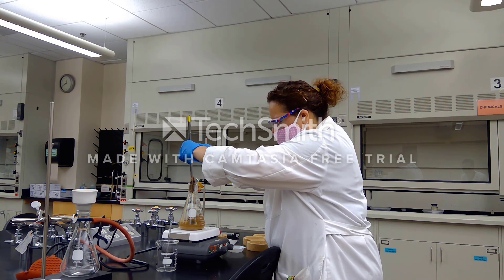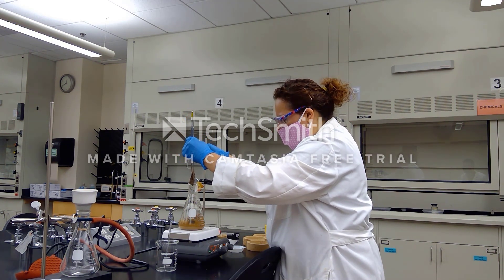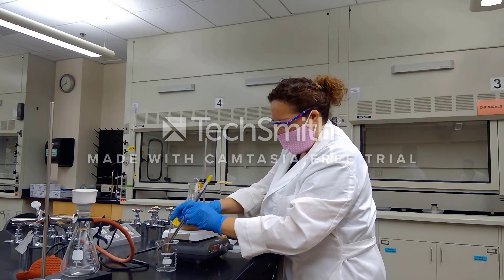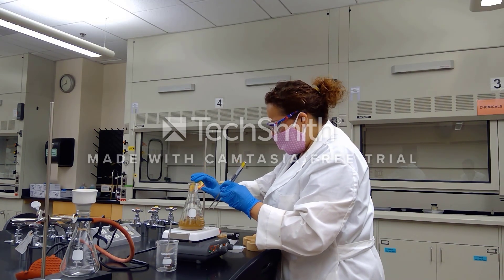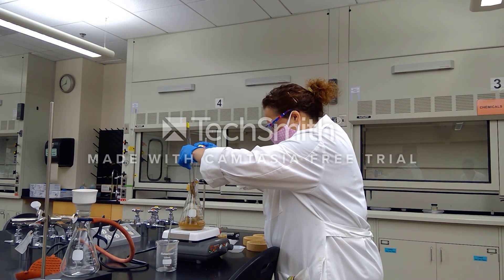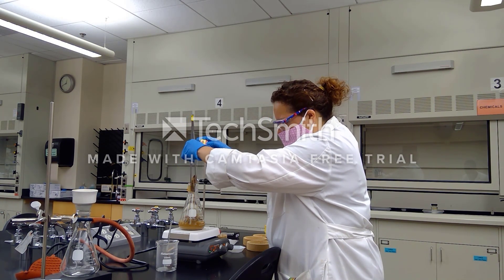During this boiling we have pretty much been performing a solid-liquid extraction — we are extracting the compounds of interest from our solid tea leaves and they are now dissolved into the liquid. This will take me a little bit to remove all of these tea bags and squeeze out the liquid, and then we will go ahead and filter this.